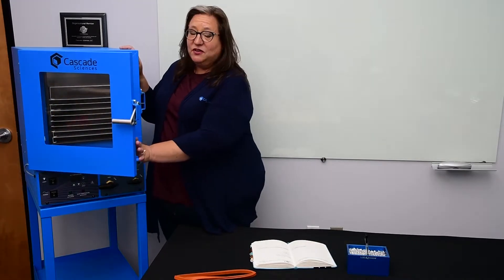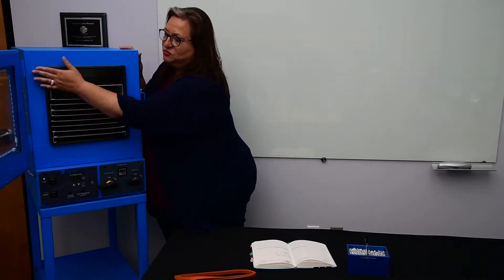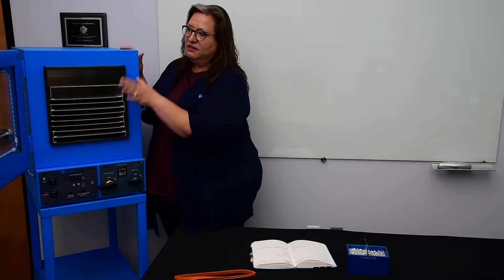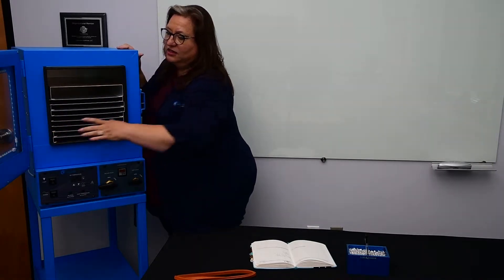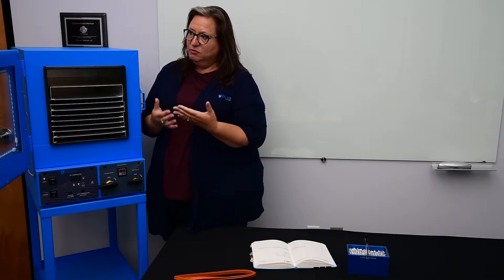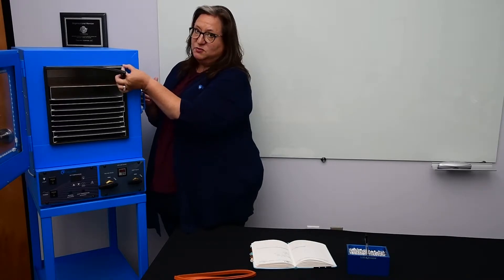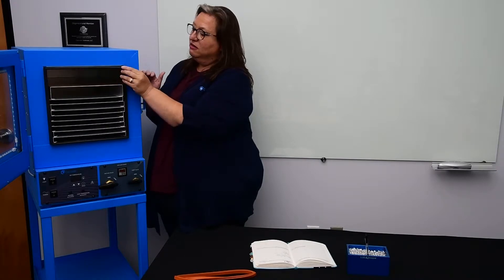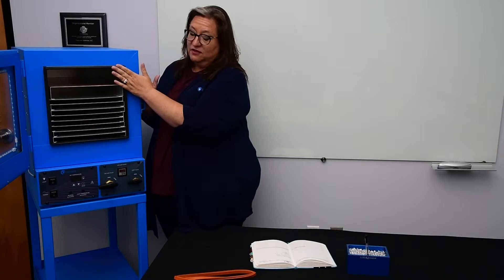On our CVO 5 and CVO 10 ovens, the glass is our actual sealing surface against the flange that hosts the gasket. The reason that this is a great technology is that this spring-loaded glass is extremely flat and provides an excellent flat surface. Our manufacturing technology robotically welds these beautiful 304 stainless interior chambers, all very uniform. They seal against the glass with the use of a gasket.